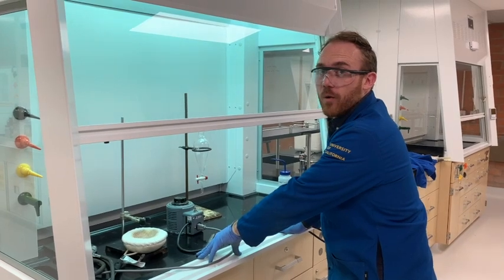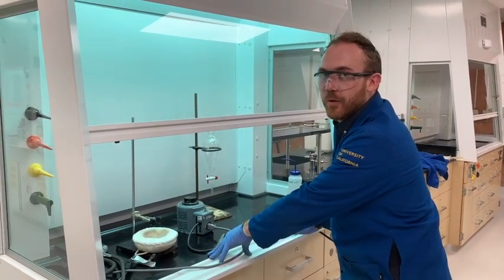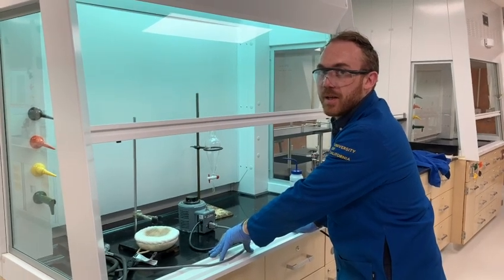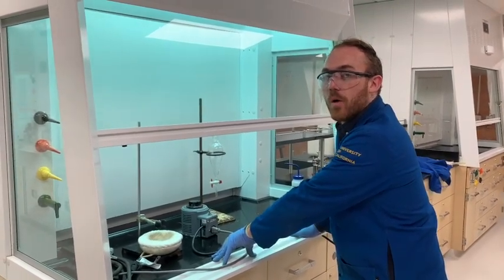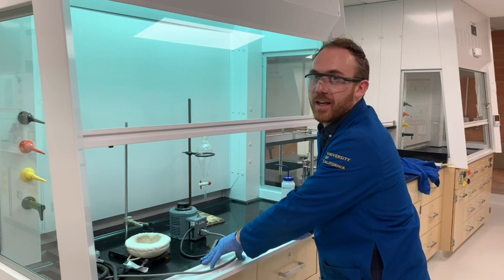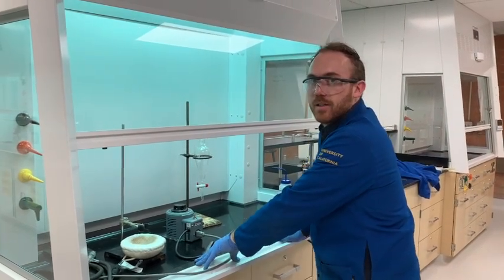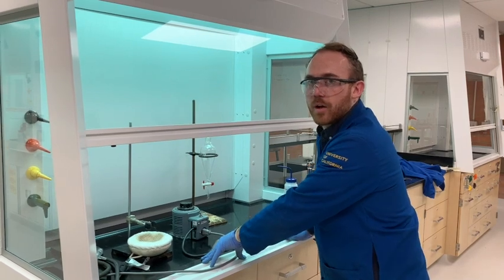Hey there! Today we're going to do the reduction of benzophenone. All we're going to be using is a couple of simple reagents: benzophenone and sodium borohydride, and we're going to be dissolving that in a little bit of isopropyl alcohol in order to allow this to reflux for about half an hour before we do the workup.